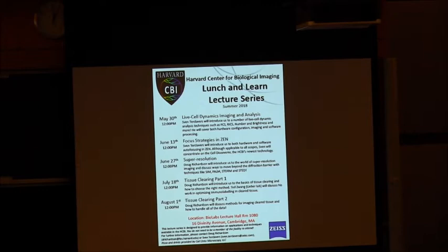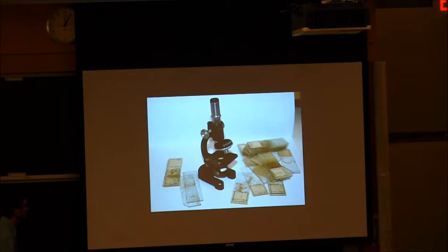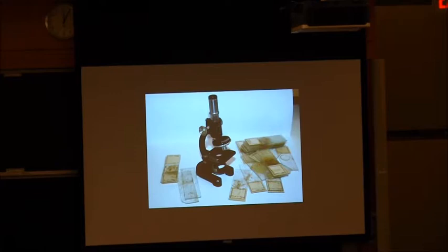So this is what we're hopefully going to get to in the end. Microscopes: this is your stereotypical high school microscope. Hopefully you have some nicer slides than these. But what I want to point out here is that when microscopy was developed, this is the sample that was always in mind for a microscope developer. It was something very small, something very thin.